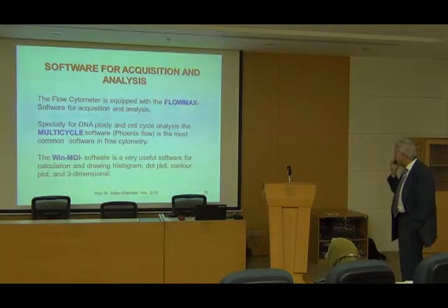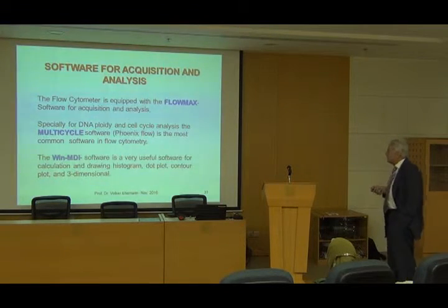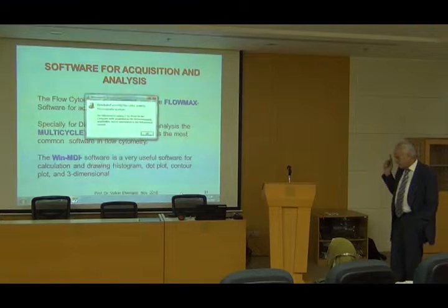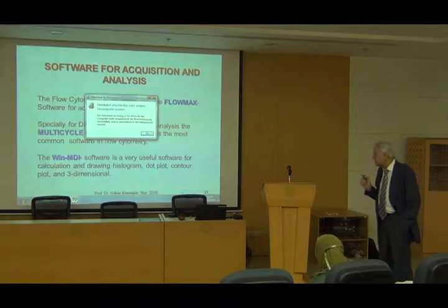The software for acquisition and analysis of the flow cytometer depends on the system.